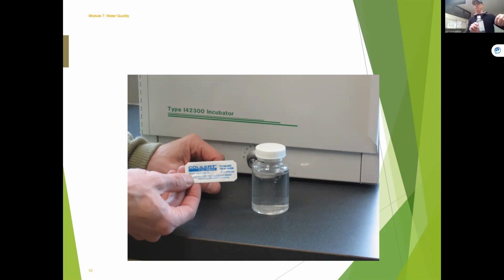You take the lid off, you fill the sample to the line. You can see it's really important. There's your line right there. And then keeping that lid down, just like what we did before, put the lid on here, and then it's nice and sealed and you're ready to go.